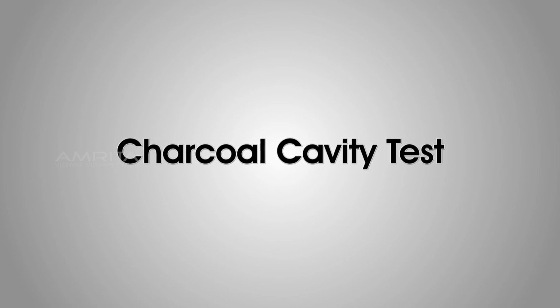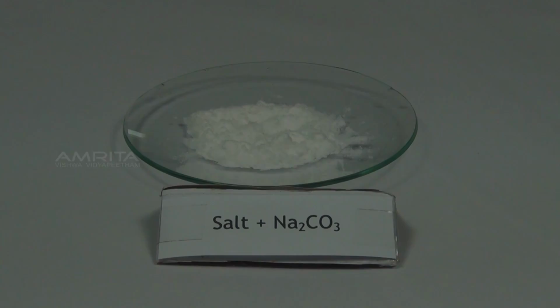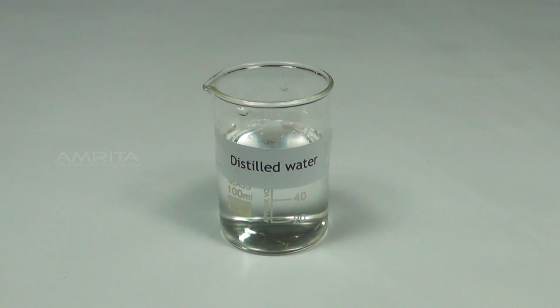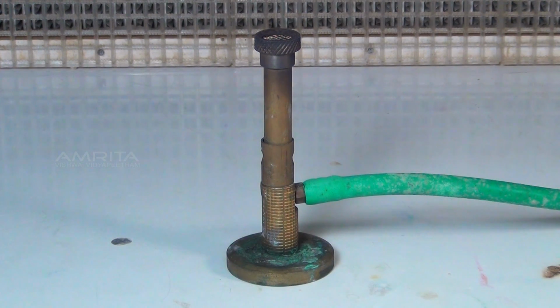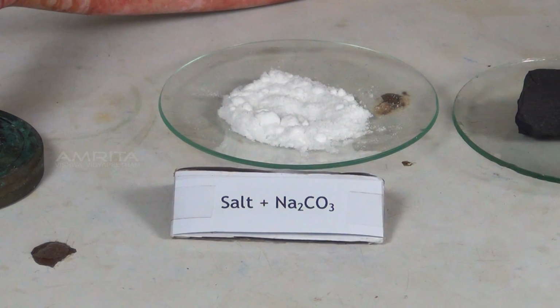Charcoal cavity test. Materials required: mixture of salt and sodium carbonate, charcoal piece, distilled water, dropper, tongs, blowpipe, and Bunsen burner. Procedure: take a mixture of small quantity of salt and double its quantity of sodium carbonate in a watch glass.